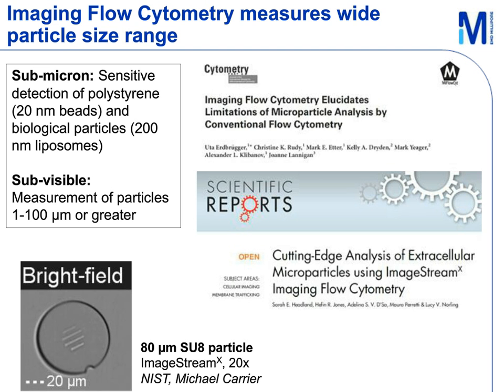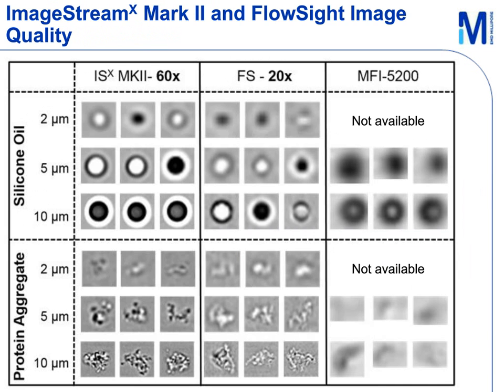One advantage of image-based particle counters is that the identity of certain particle types can be determined based on the morphology of images collected. This has proven especially useful for discriminating protein aggregates from silicone oil droplets, as both particles have distinct morphologies. However, this approach is only useful for particles of a certain minimum size, which produce enough pixel information for these physical differences to be captured in the image.